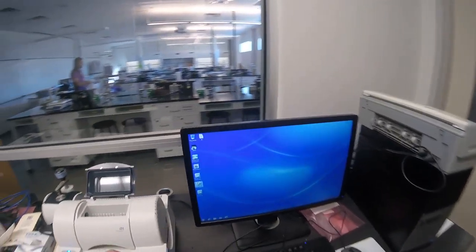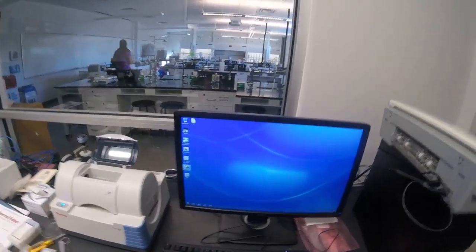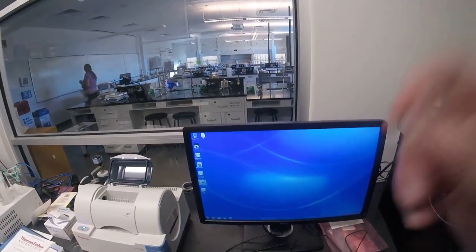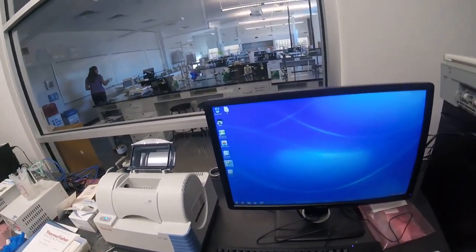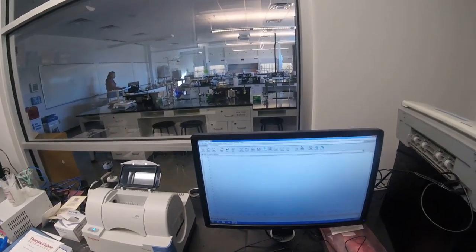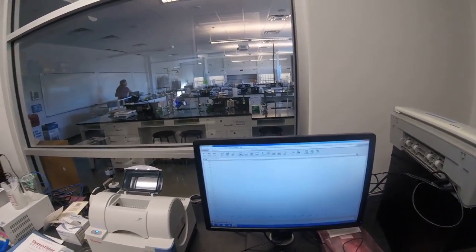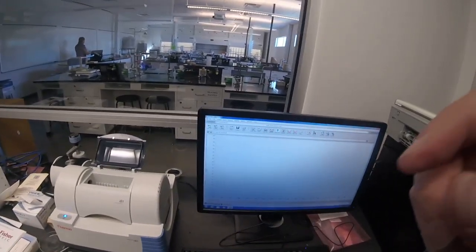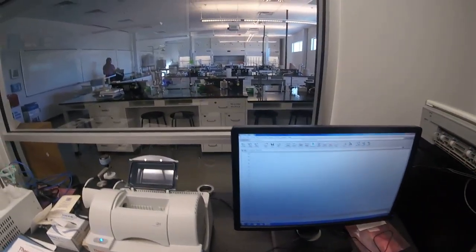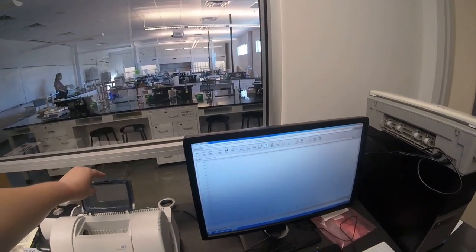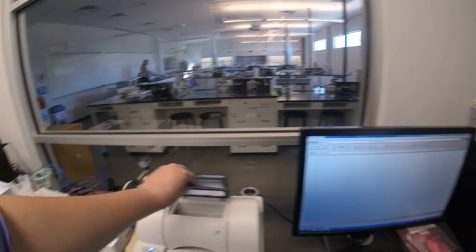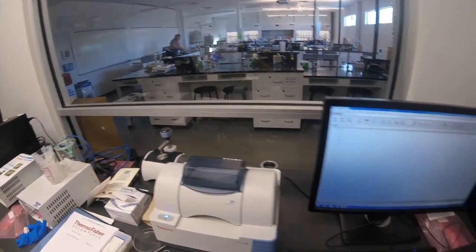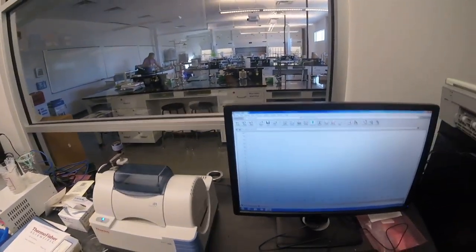This is the computer that we're going to use. It should be on before you start. We're going to double click on Omnic to make sure that it's ready to go, and the very first thing you always do when you're doing this is you close the lid and you run a background.